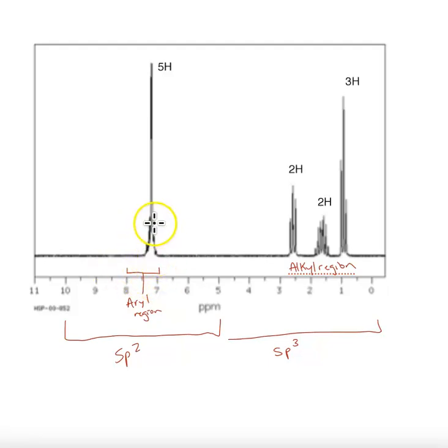So I'm again thinking we might have a benzene ring here, and it would make sense if our benzene ring had 5 hydrogens attached to it, because our 6th carbon is looking like it might have a carbon chain attached to it, which is what these hydrogens moving down our HNMR graph are telling me.